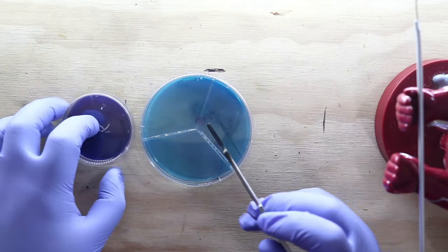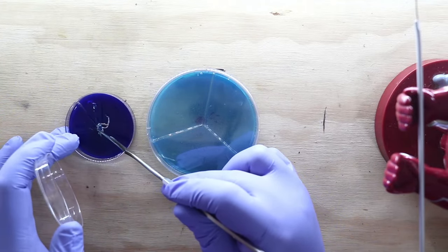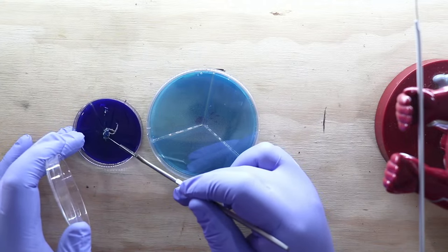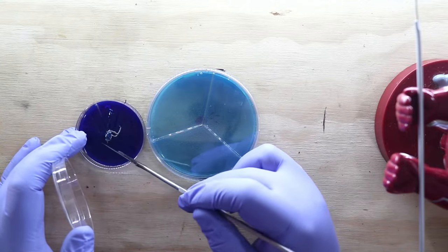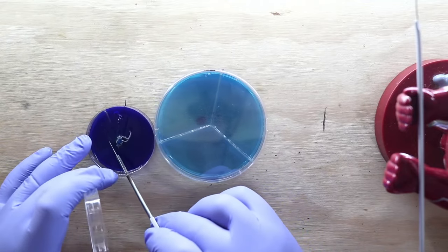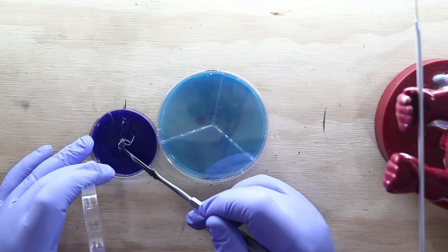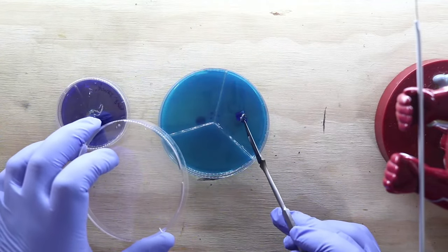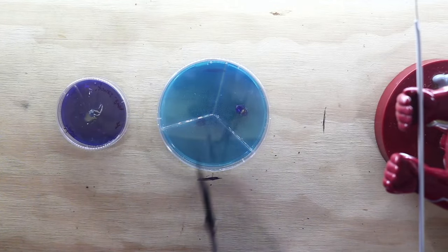So I've cut that. I'm now going to come over here and I'm going to cut into this chunk. Boy, that is hard. Oh, look at that. I'm going to have to cut those rhizos. You have ropes. It's clinging onto everything and growing through everything. Yeah, I'm going to pull the whole dish out. I'm very unfamiliar with honey mushrooms, guys. I don't work with them very often. So we'll place that right in there. And there's one transfer done.